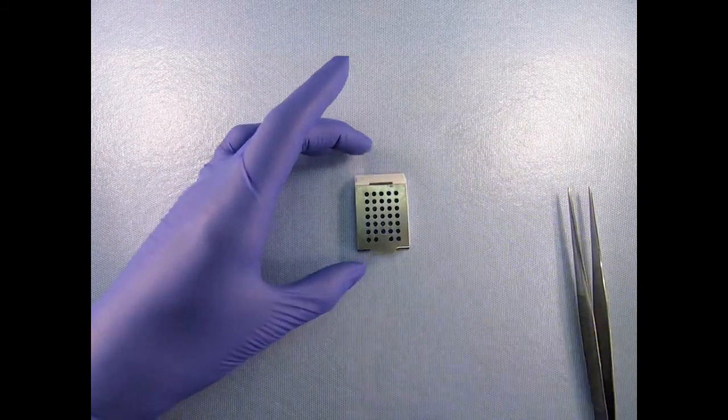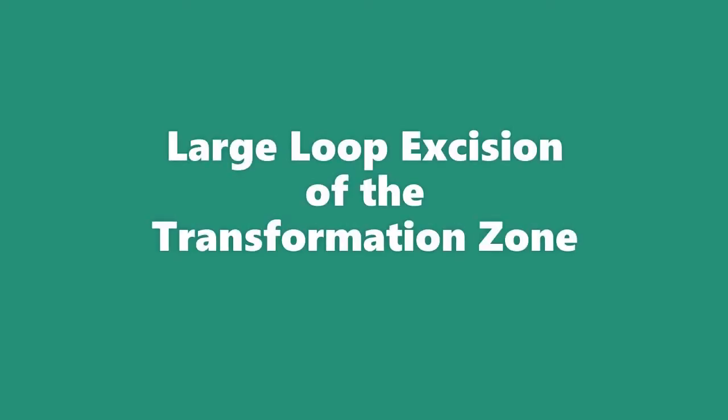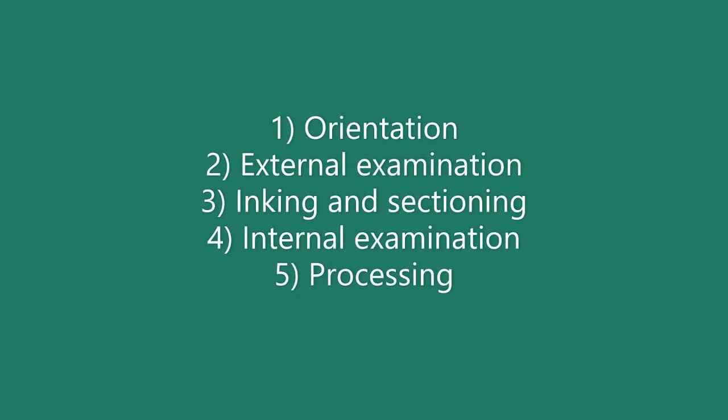Thank you for viewing. We'll learn how to handle LLETZ specimens. This video will illustrate the dissection of a cervical large loop excision of the transformation zone. This video will cover orientation, external examination, inking and sectioning, internal examination, and processing.